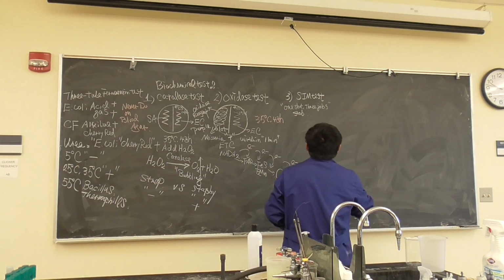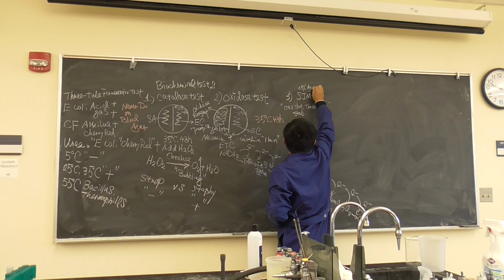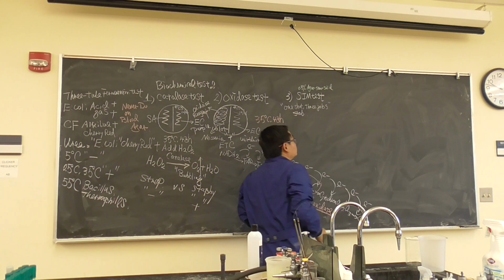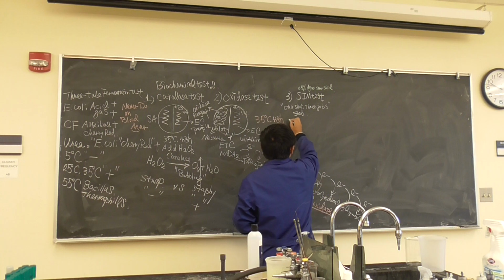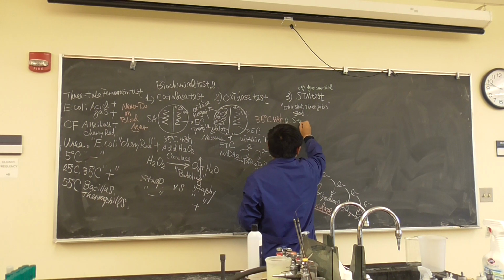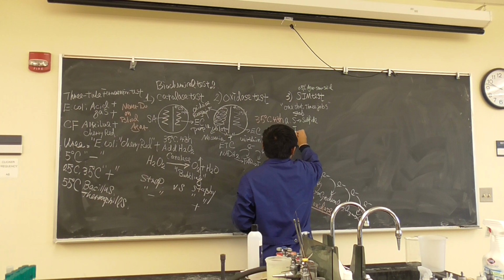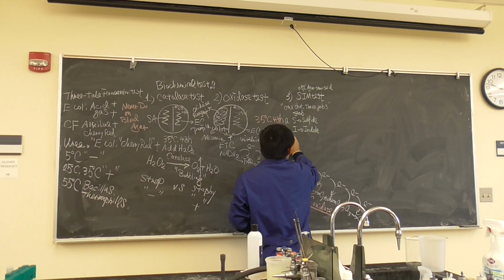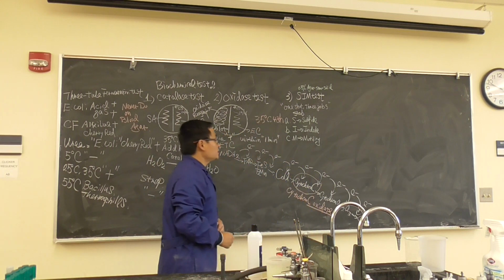Why? This is a 0.5% agar semi-solid medium. Why do we want to make it semi-solid? Because we are looking for 3 things. Number 1, S indicates sulfide. What is I? I indicates indole. What is M? M indicates motility. So let's talk about these things first.